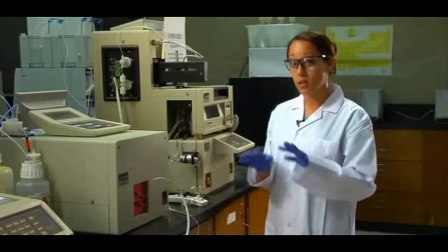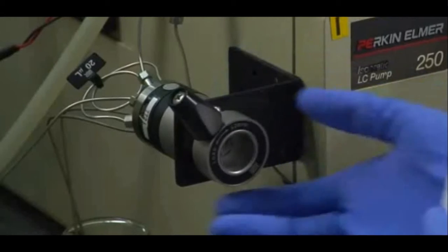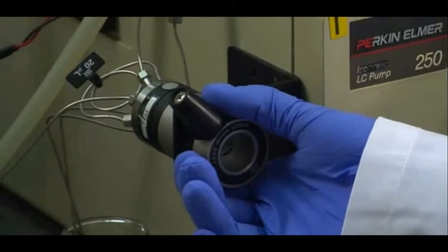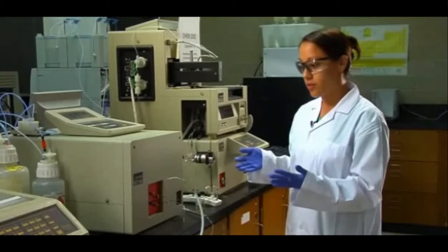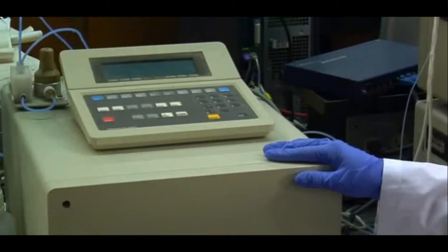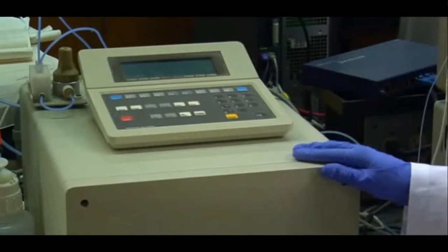Another important part in any type of liquid chromatography is your injection port, which is very convenient because it helps you inject a consistent volume every time. Usually your detector will already be set up. Today we're going to be using a diode array detector, but we'll be using UV-Vis absorbance.